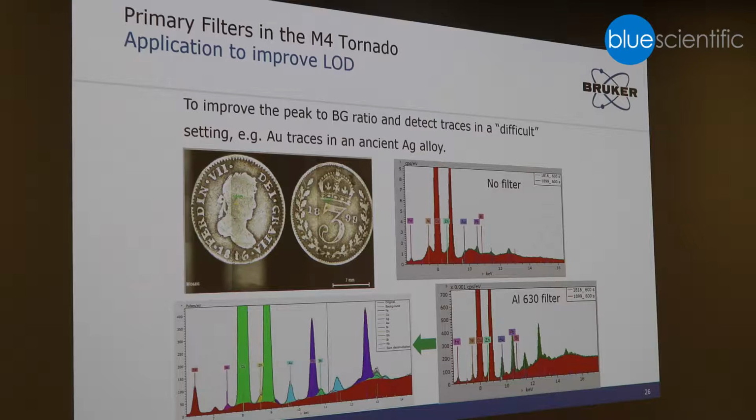the detailed information. And what really makes it interesting is that the coins may look apparently the same from the surface, but if you do the analysis, you can see that one silver coating is contaminated with gold and lead, and the other one, which got minted later, doesn't contain these trace elements.